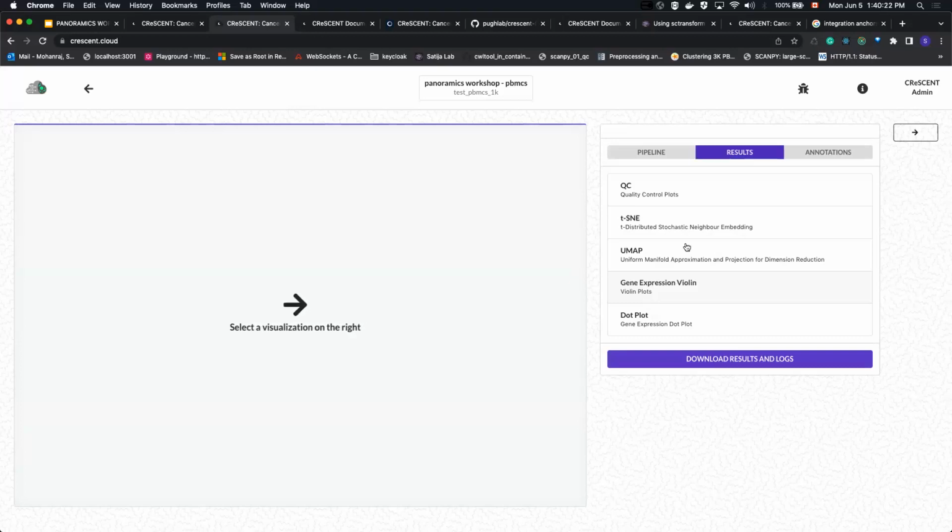But for the most part, batch correction is usually between different batches, like you said. Right? So in this case, that one single data set is probably one batch, like one experiment is usually how it's grouped. But you can choose to split that up however you want as well. If maybe you have 2 different treatments, and even though they were run at the same time, maybe you do want to do a batch correction anyway, right?